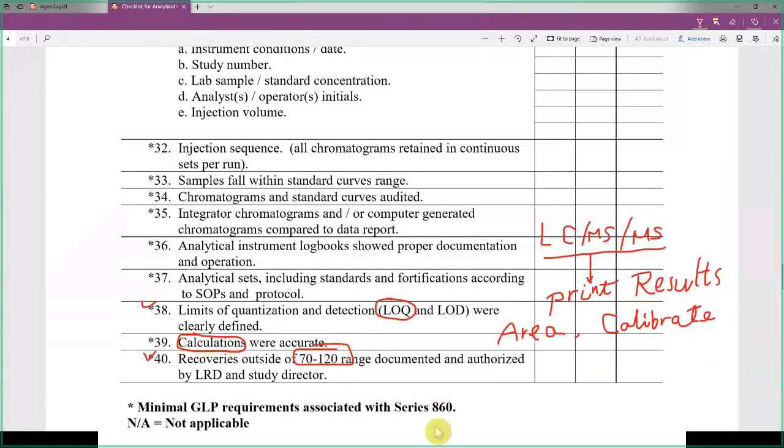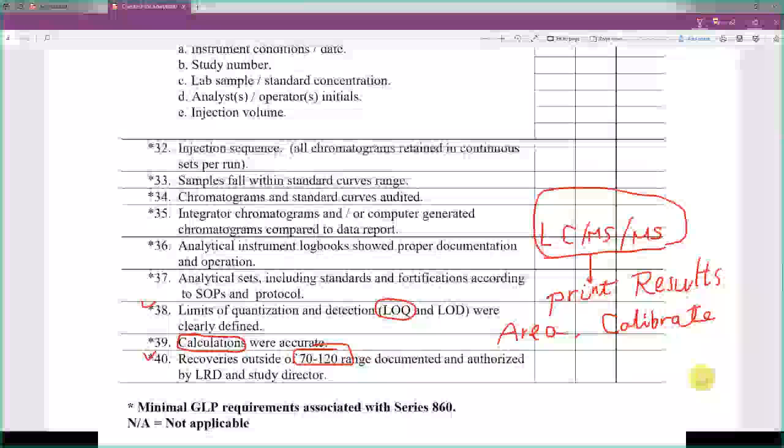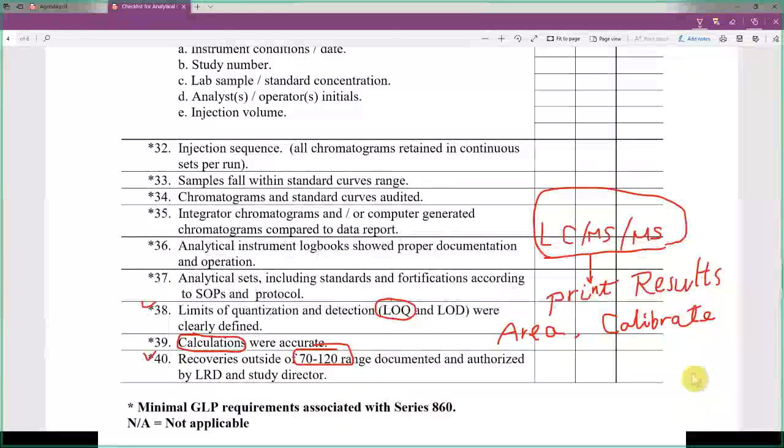And this is important because you don't rely on one method. Sometimes there will be a mistake. Sometimes you select the wrong parameter. For example, for an instrument like LC-MS, if you select a different parameter, your result will be different. So a lot of times people ask, are you doing this right? And have you validated this? So in this case, you have to show all the ways for people to calculate themselves, not only rely on your printout. So that's important.